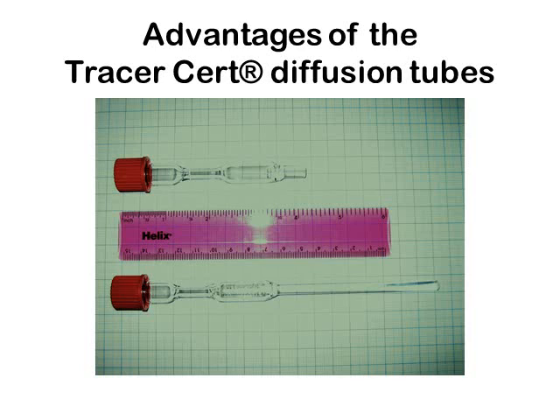Each tube is uniquely identifiable with an easily readable, laser-engraved, individually assigned code, making them very useful in quality assurance schemes. Tracer Measurement Systems Limited has a record of every tube made and sold. Neither Tracer nor Eco Scientific will deal with inquiries about tubes which are not genuine Tracer Cert diffusion tubes. Such copies are likely to be very inferior attempts at making our high-quality precision products.